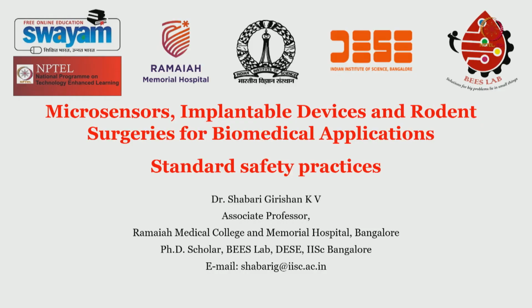It's very important to prevent acquiring any infection from the animals that you're handling, and protecting yourself is of utmost importance when you're handling lab animals. By and large they are clean, because obviously they are from labs which are bred for the sake of experiments. However, there are still many diseases which can go unnoticed within the animal, and that can get transmitted to the personnel who is handling the rat, that is, you if you are handling these lab animals.